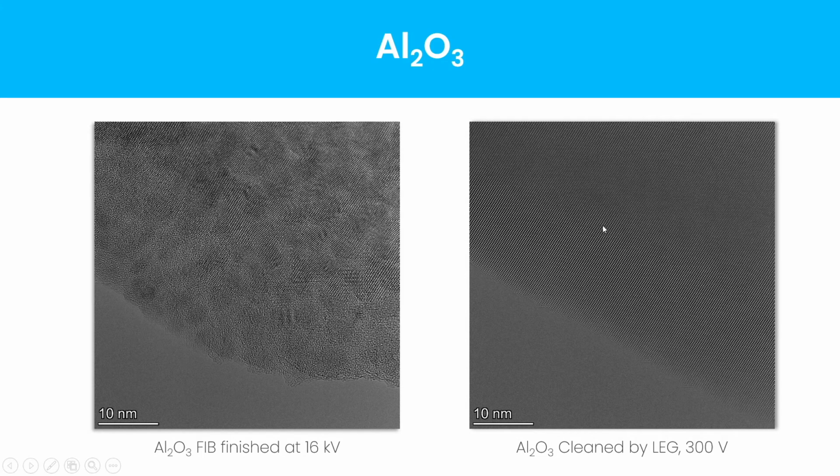Here, as this is a wedge, you see this material slowly disappearing in vacuum. Here is the edge of the sample where the contrast of the lattice is already very weak, but still you see the lattice image at the very edge of the sample. And with this I give the stage back to Andras.